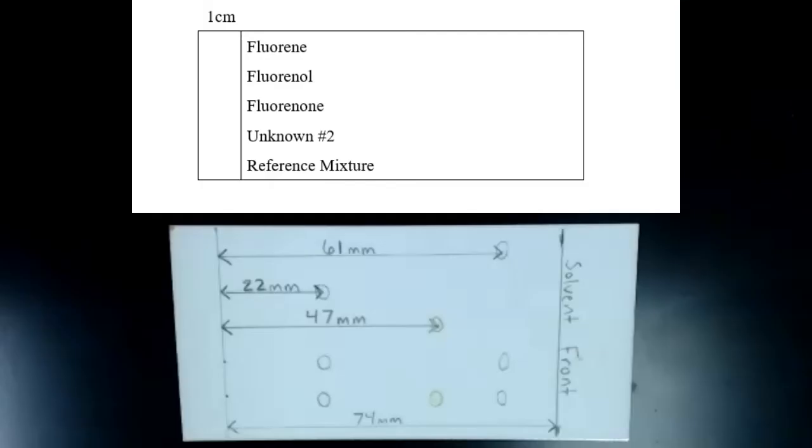This is our fully developed TLC plate. You can now calculate the RF values for each of our three compounds. You can also identify the compound or compounds that were in our unknown mixture. This concludes Part A of this experiment.